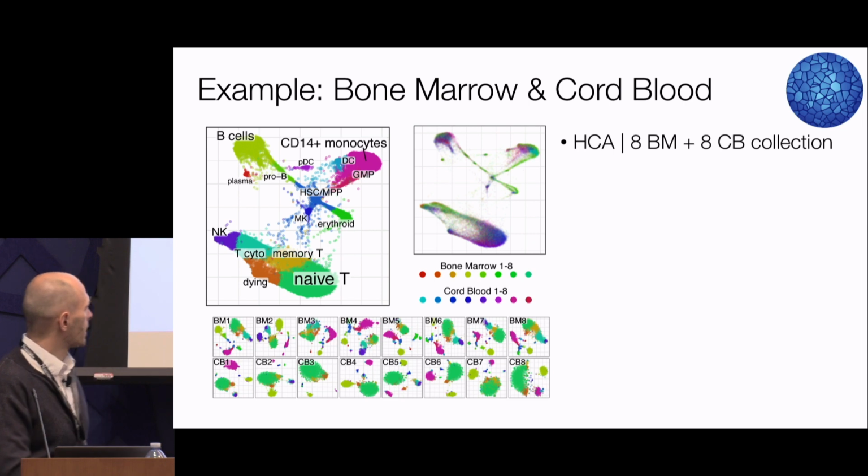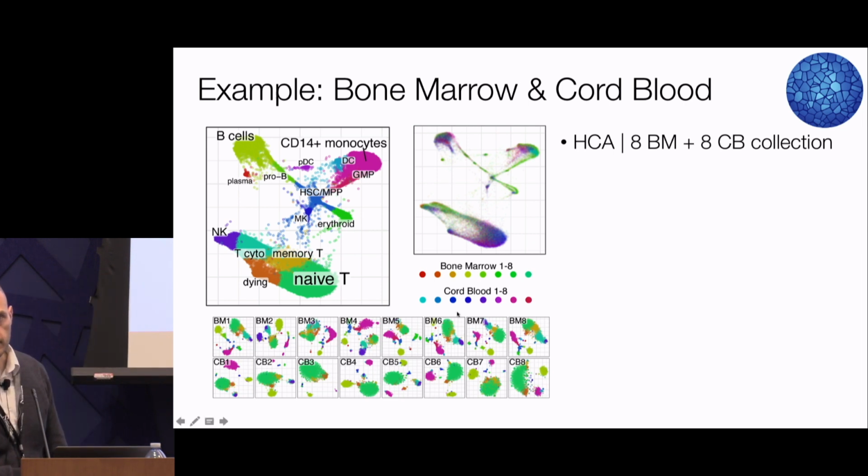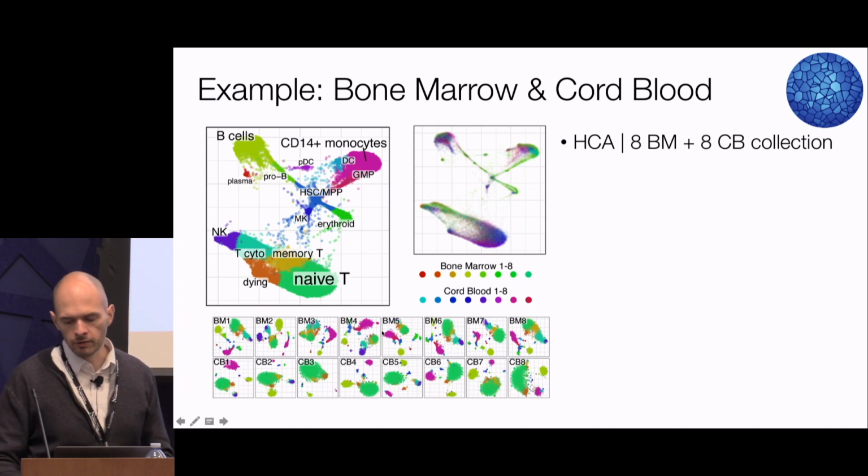Now, if you look back at the individual samples, here are just the individual t-SNE plots for each sample, colored using the same joint clusters. You can go in and see that this pink cluster corresponds to this pink cluster, and so forth. So it basically gives you an initial way of starting to do joint analysis.